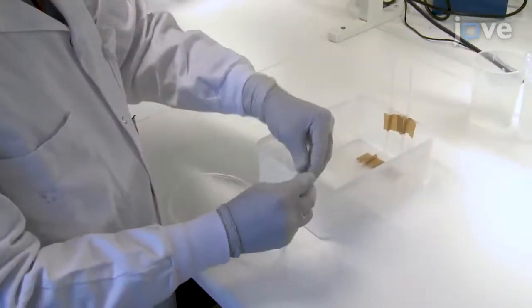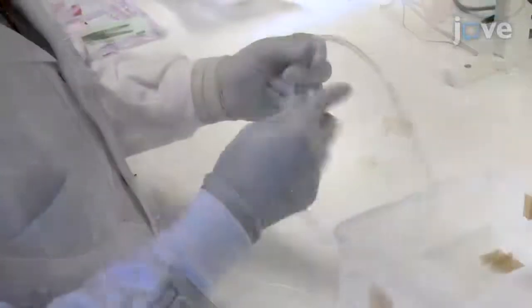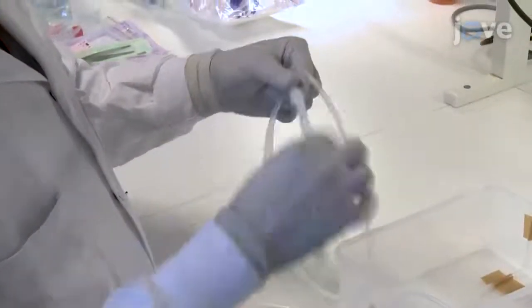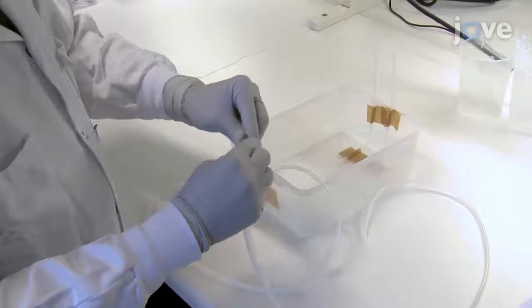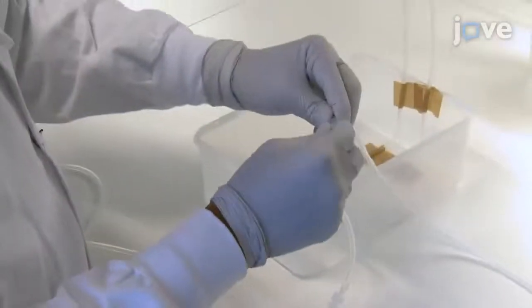Connect the detergent's inlet tube to tube B using the male and female lure connectors. Then connect tube B to tube F, and tube F to tube C. Connect tube C to the vein inlet.